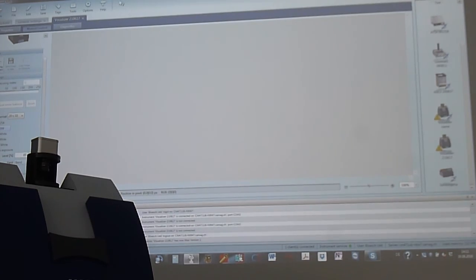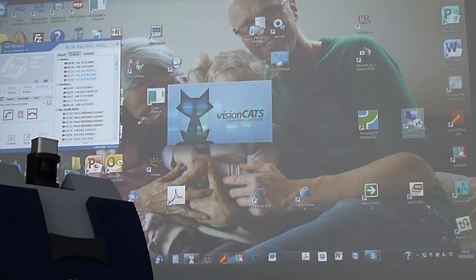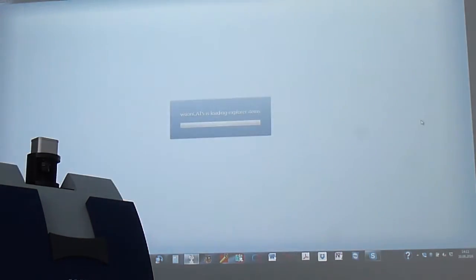The visualizer has still a yellow sign. Yeah, the yellow sign is just that the diagnostics is not made. Let me reopen that and show you. So the yellow triangle is just that there is no valid diagnostics. You can run it here. This sign shows just that there is no diagnostics. The connection is shown here, this down one. And this is for visualizer two too, the first one.